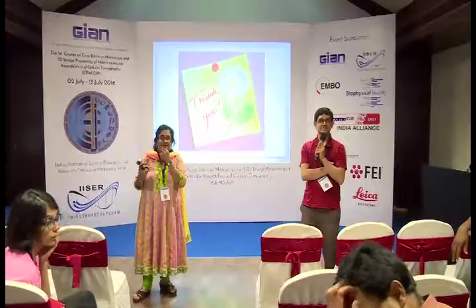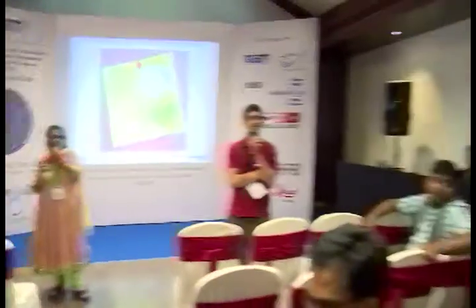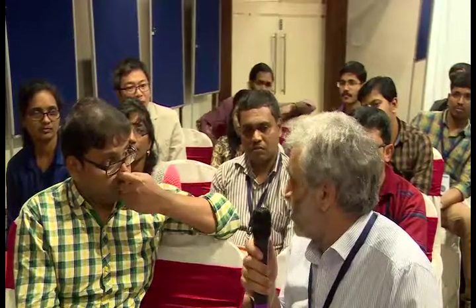Can I add something? What do you mean by energy? We have different energy models, for example universal or other energy models. You are just saying a few words, and I want to know how you calculate it. Energy is nothing more than a logarithm of probability, and probability is how well one thing describes another. If you use a restraint, if you use a fit into the map, all of them give exactly the same thing. You could use a goodness of fit, that is energy, if your energy is a Gaussian distribution.